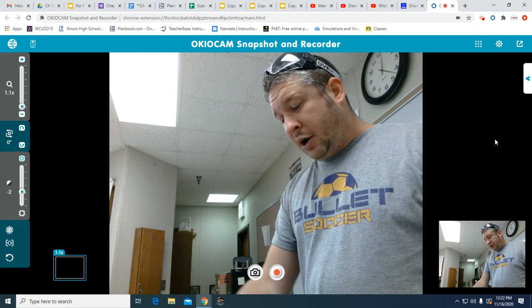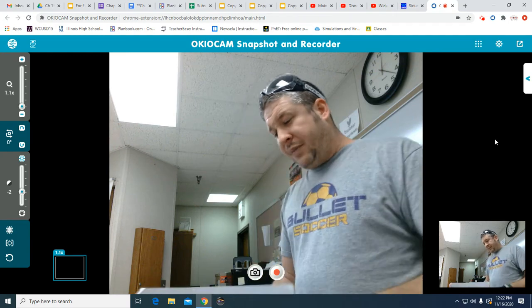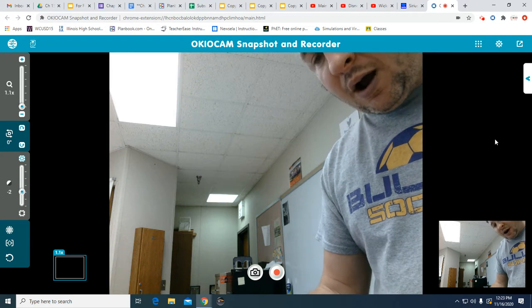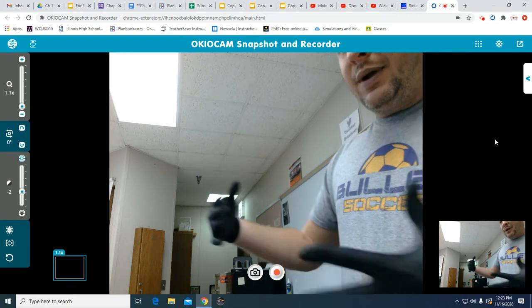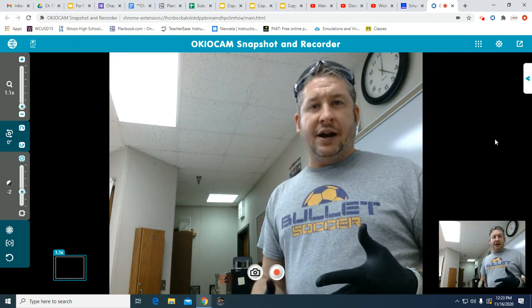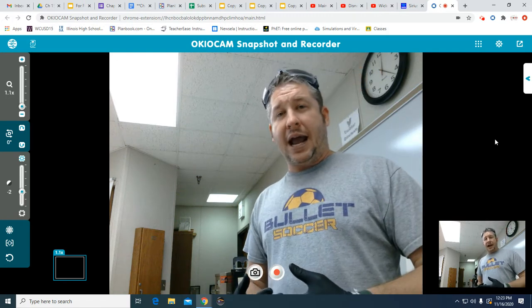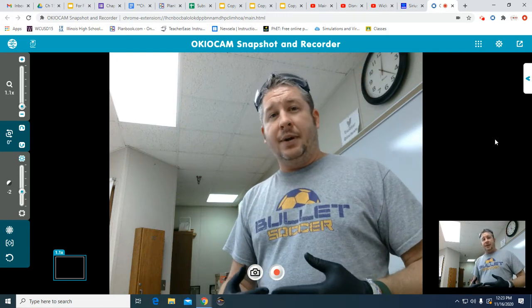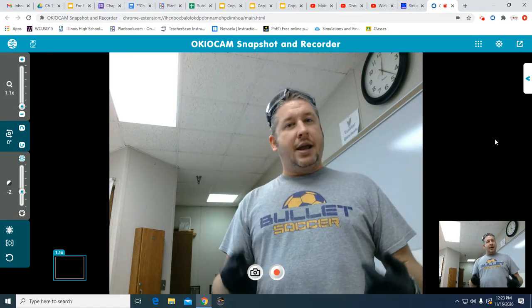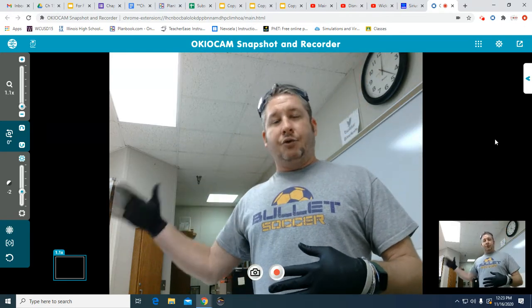Anyway, what we're going to do is go through the first series of steps. For the initial part, we are going to get through probably about number 10. And then we are going to have to wait about 15 minutes. That's when I'll pause the video here and there and show you what's happening with the reaction. And then after that time's up, we'll move on from there. But this is a 2-day lab. And really the second day isn't that long. It's just we have to let the material that forms dry overnight.